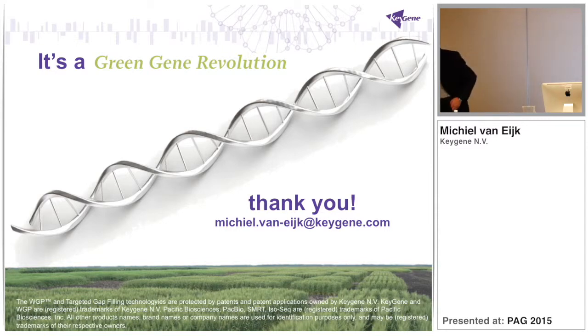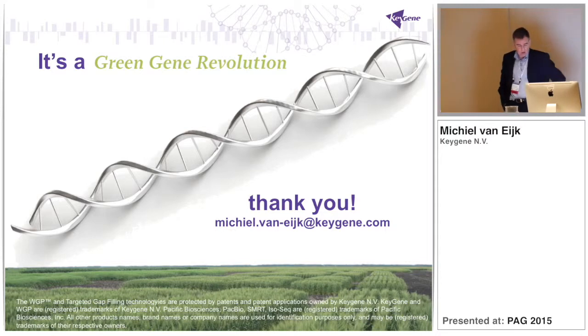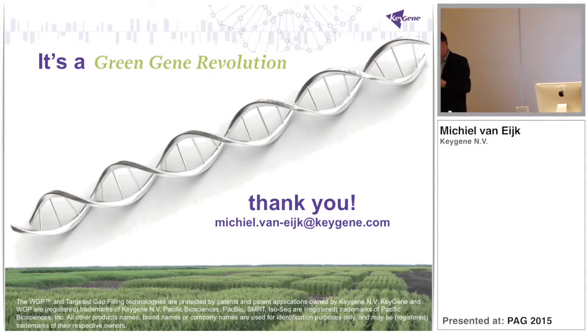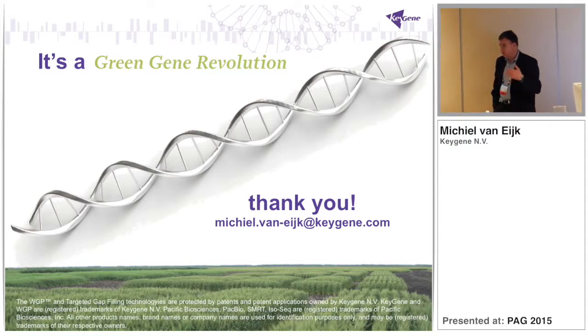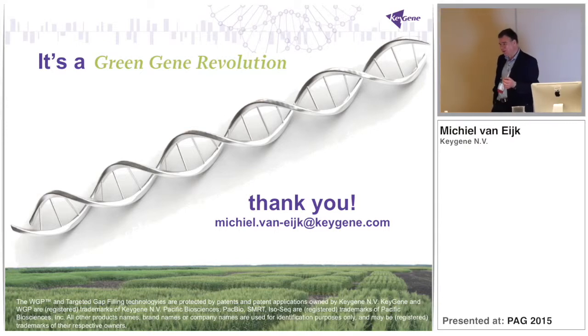If you increase the PacBio X coverage, can you get away without doing the whole WGP? Yeah, that's a very good question, and well, actually, what I believe is that with a higher depth of coverage of the PacBio sequencing, we will probably get better N50 metrics than what we have achieved in the case of cotton. But I would certainly very much doubt whether there would be a 20 to 30-fold lower number of contigs. So the number of contigs will go down, for sure, but not at this rate.